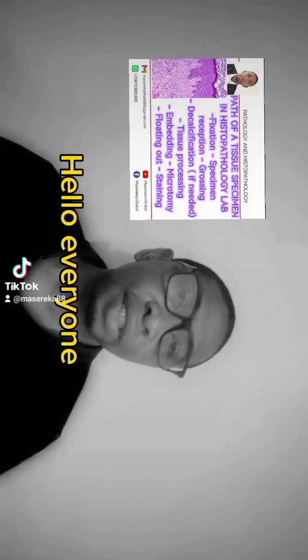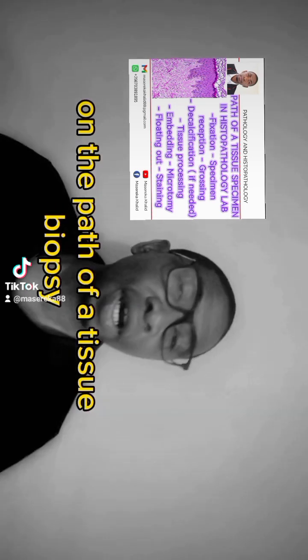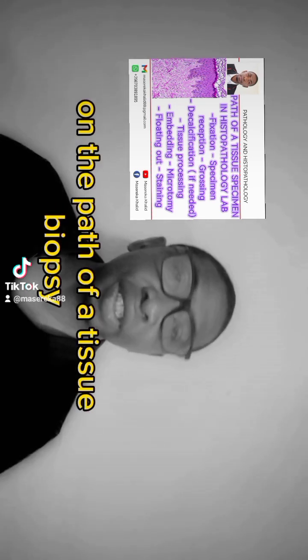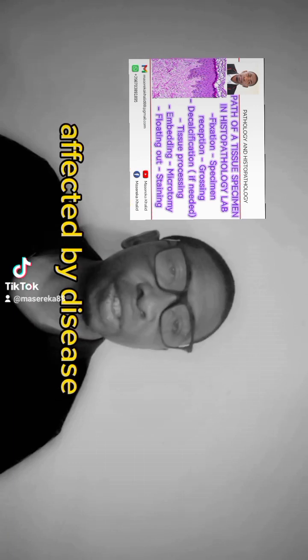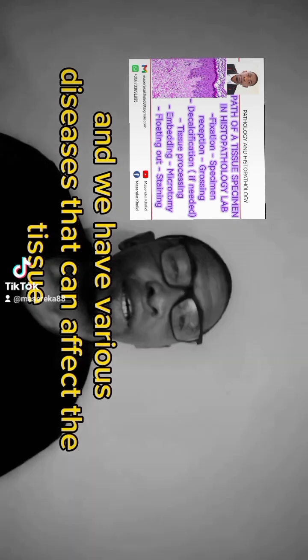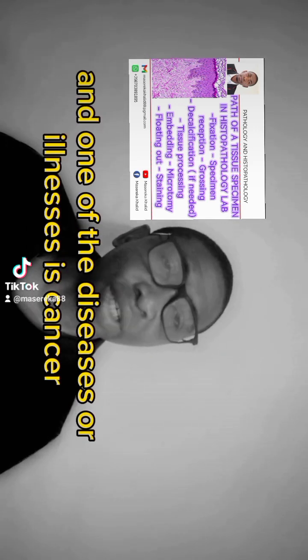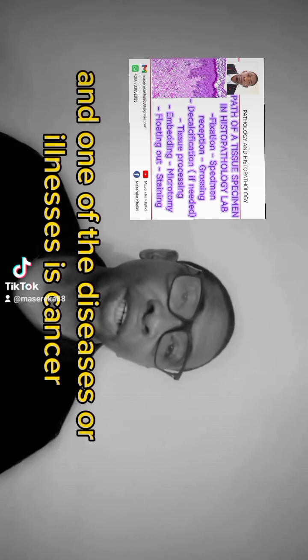Hello everyone. Today's discussion is going to focus on the path of a tissue biopsy in the histopathology lab. To begin with, histopathology is the study of tissues affected by disease. And we have various diseases that can affect the tissue, and one of these illnesses is cancer.